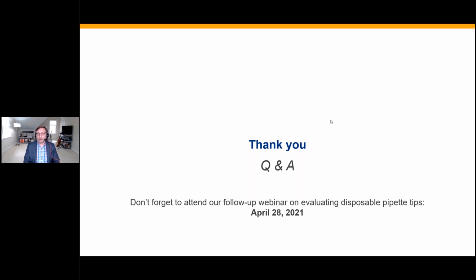Well, it depends. I'll just tell you that if you're looking at nanoliter and picoliter, a common platform are these acoustic dispensers, but there are a lot of arrayers out there. There's companies that specialize in these low volumes. So it just depends on what you mean by low volume.